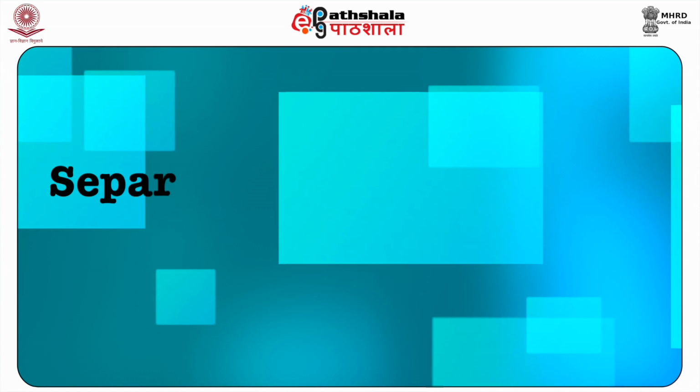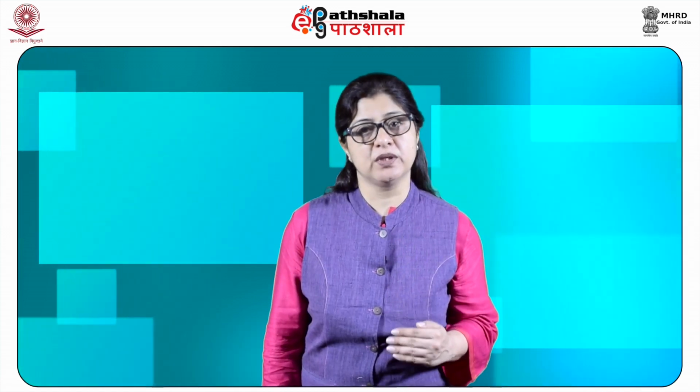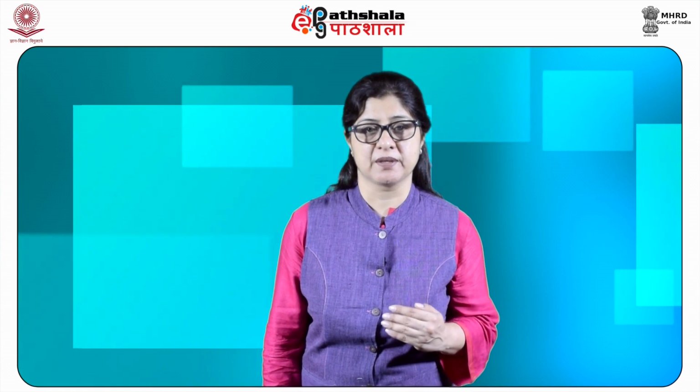Separation of lanthanides. During the Second World War, the separation of fission products presented a major problem to the analytical chemist, especially the mixture of lanthanides, Sm, Eu, Gd, cerium, Pr and the other transition metals as well as the mixtures of cesium and rubidium, strontium and barium and zirconium and niobium in the tracer amounts.